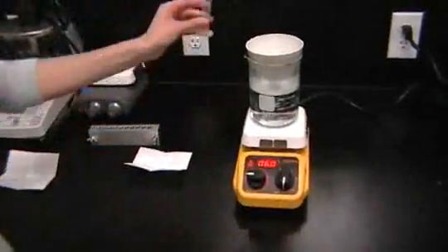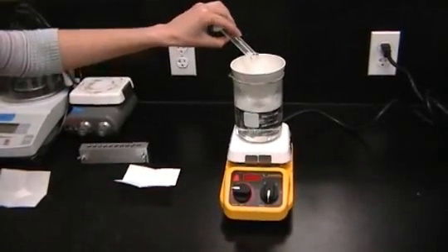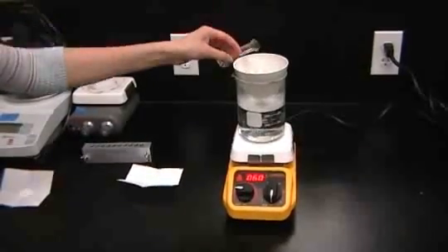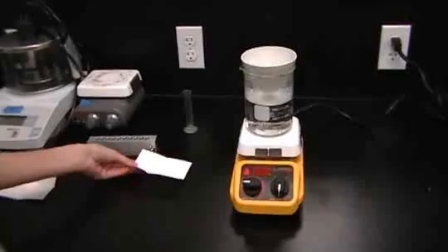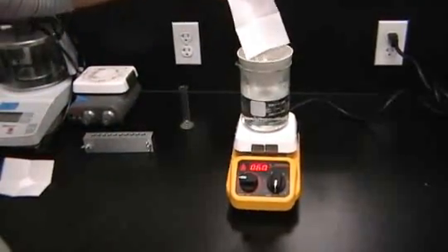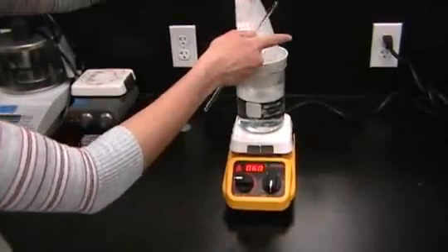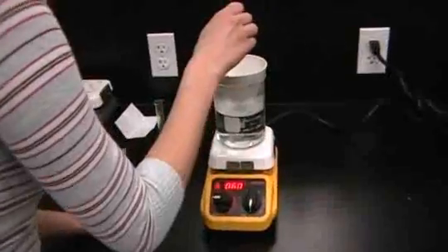Your PEG, you're going to add your PEG 400 first into its crucible. Then you're going to add PEG 8000. If you notice, the temperature of the water underneath the beaker is kept at 60 degrees. In both the cocoa butter and the PEG suppositories, it is essential you keep the temperature at 42 degrees and 60 degrees respectively. Then you can stir.